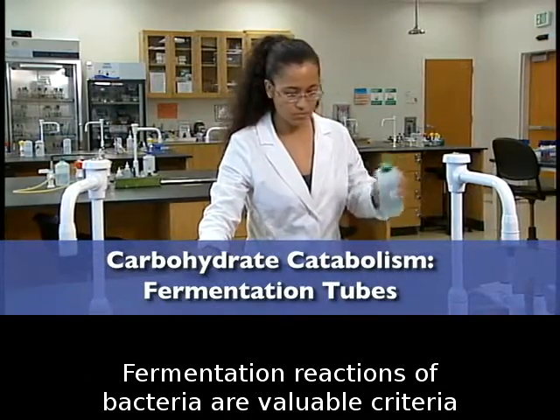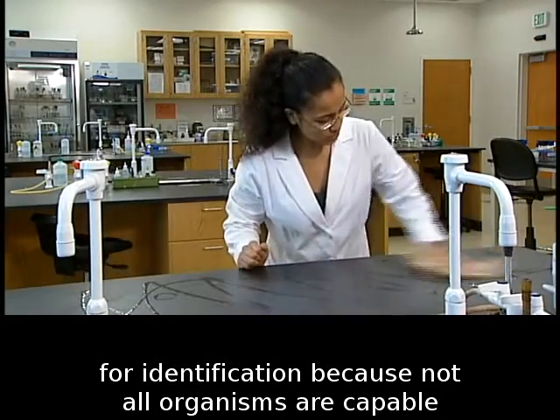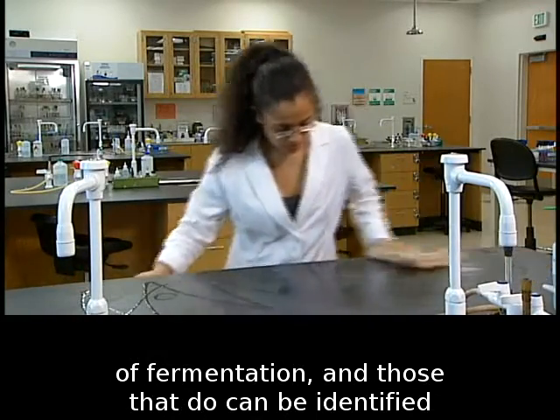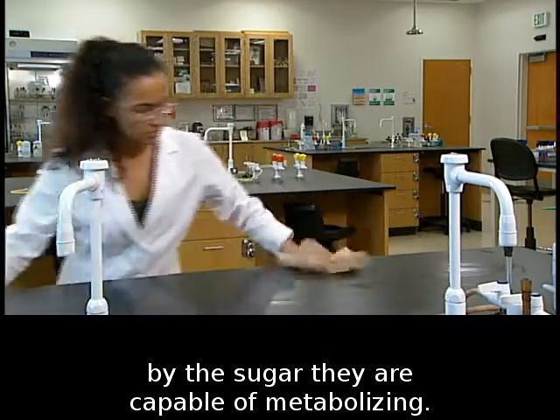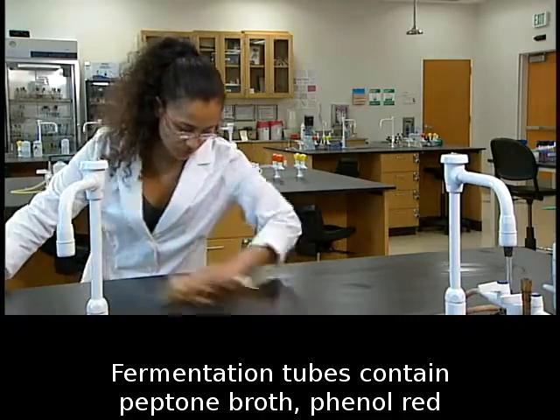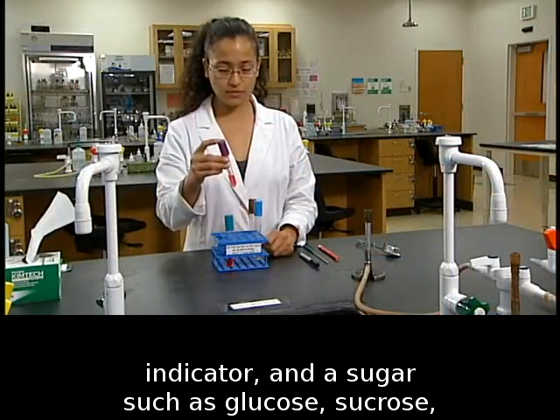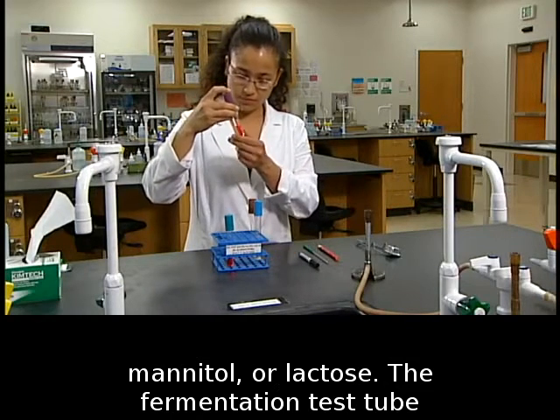Fermentation reactions of bacteria are valuable criteria for identification because not all organisms are capable of fermentation, and those that do can be identified by the sugar they are capable of metabolizing. Fermentation tubes contain peptone broth, phenol red indicator, and a sugar, such as glucose, sucrose, mannitol, or lactose.